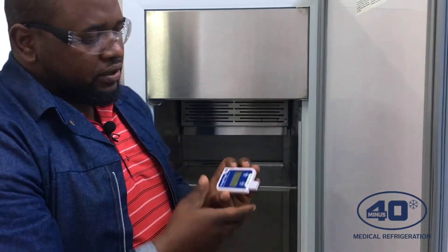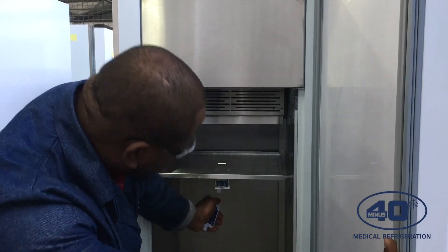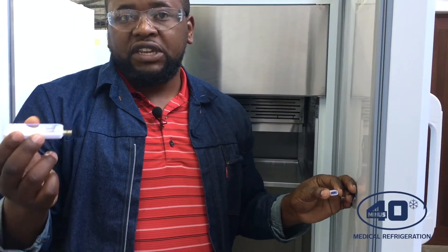Anytime you want to pull a report, you just unclip it from the fridge, then use your laptop or PC and plug it into your USB port. You will then be able to generate a PDF report with graphs. The second report is a summary of every 10-minute temperature reading.